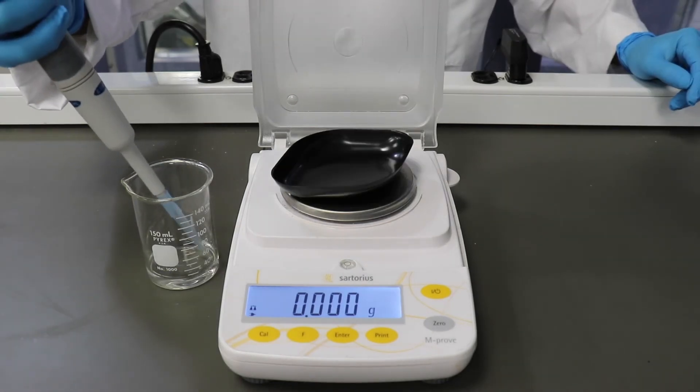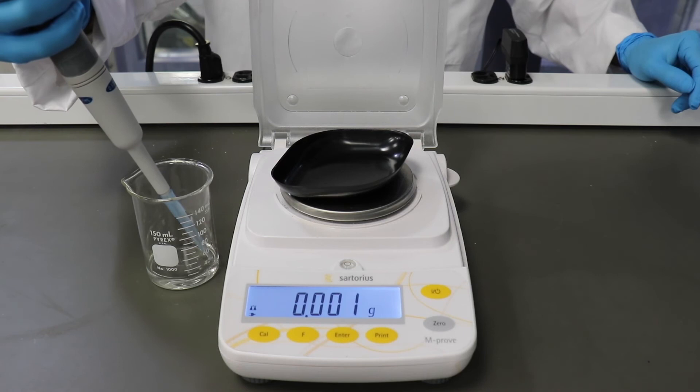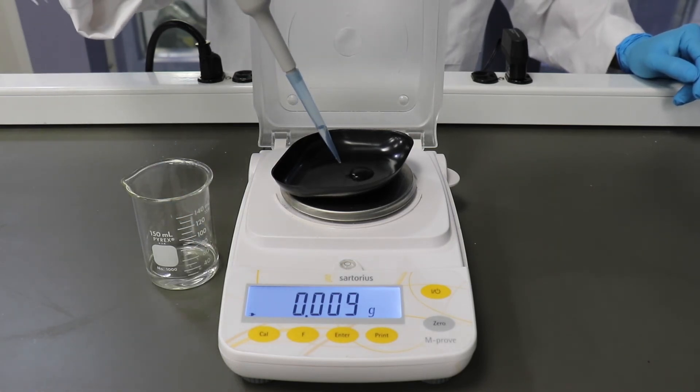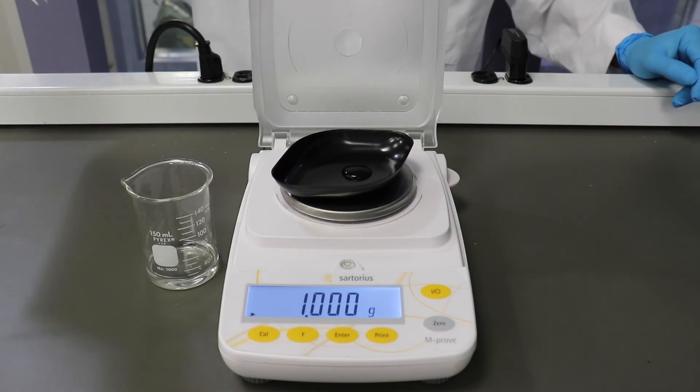If the readout still doesn't come close to what it should, simply repeat the previous steps until the volume of liquid closely matches the value on the balance.